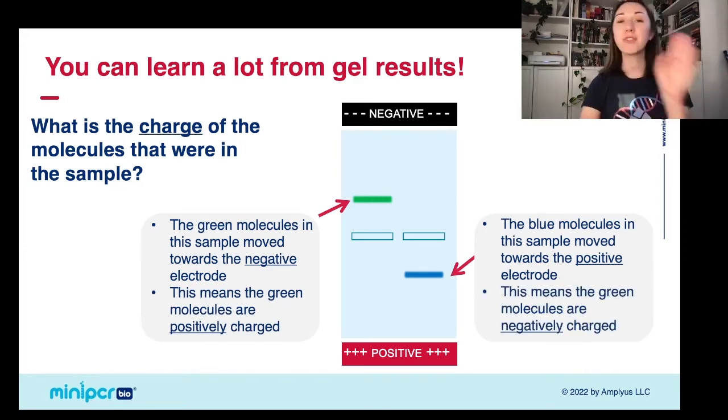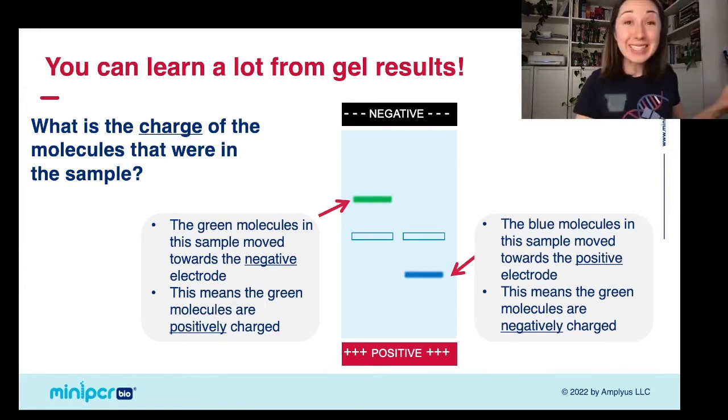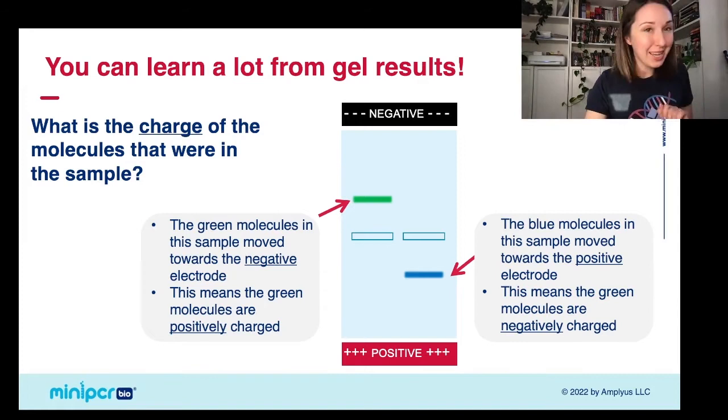So that's the first thing that we can tell and that we're going to be able to tell when we look at our gel results that are running really nicely on the gel next to me. I can't wait to show them to you in a second. We're going to be able to tell the charge.